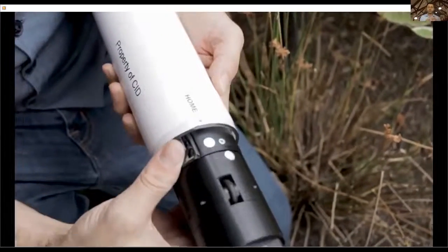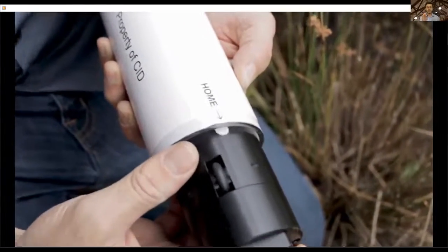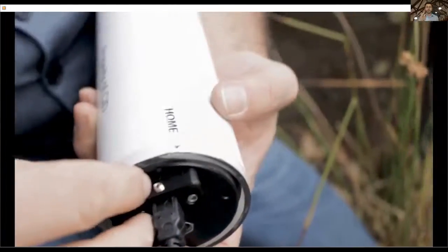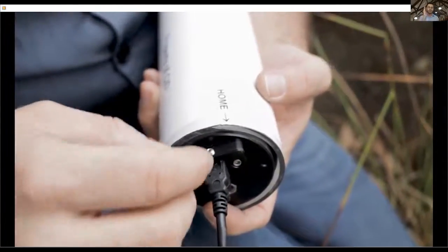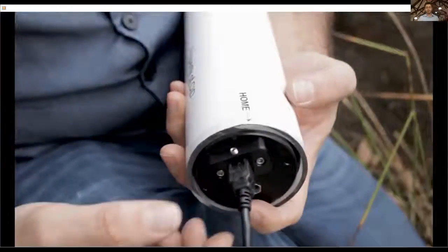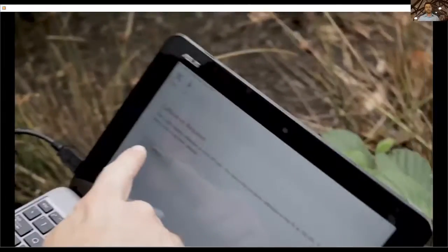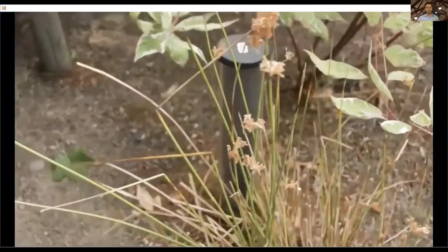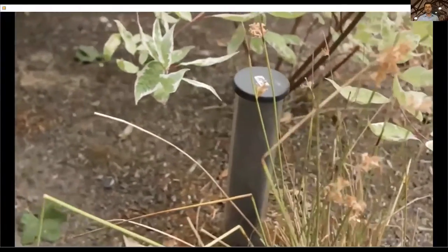And we do suggest that when you're doing your individual tubes, you actually utilize those 2 dots as well, kind of marking it at each one of the tubes. That way, when you're doing your scans and you're placing it in, you're just getting the exact same scan location every single time. We find it just makes research and data a lot easier. It's not a complete detriment if you don't, because it is a 360-degree scan.